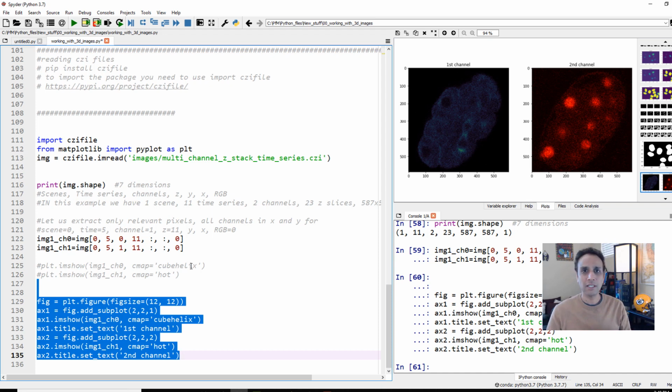So this entire tutorial turned out to be just a tutorial on how to use for loops to go through this NumPy array, but this is it. If you really would like to apply a lot of filters onto your images slice by slice, this is how you do it.